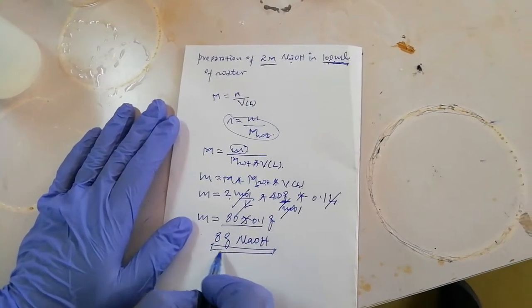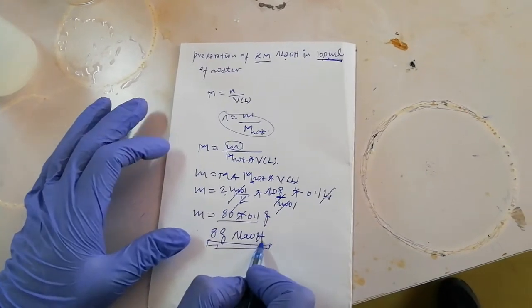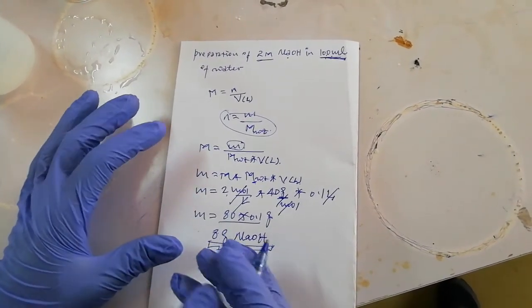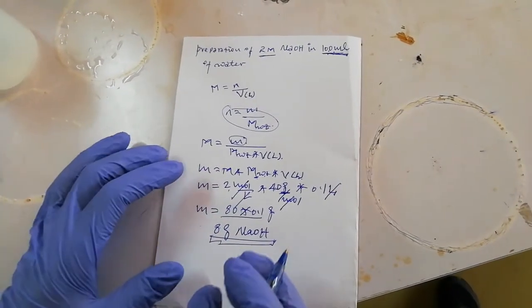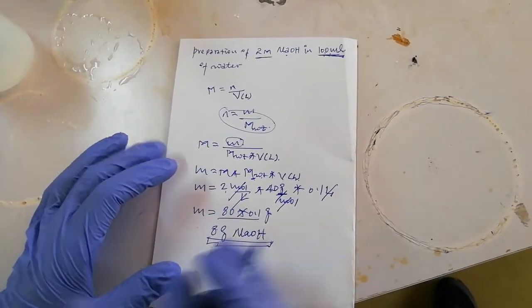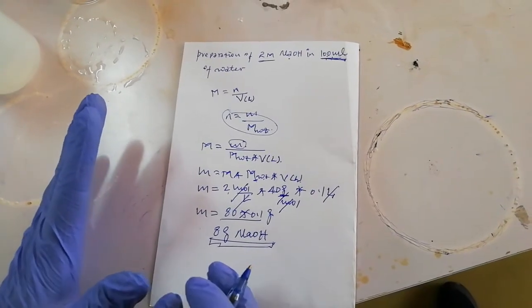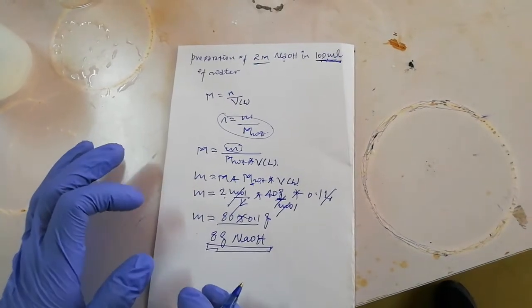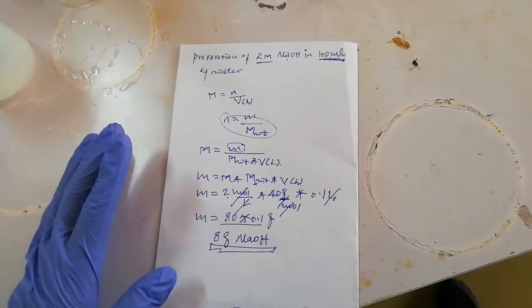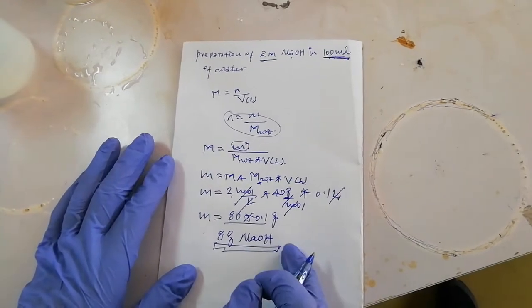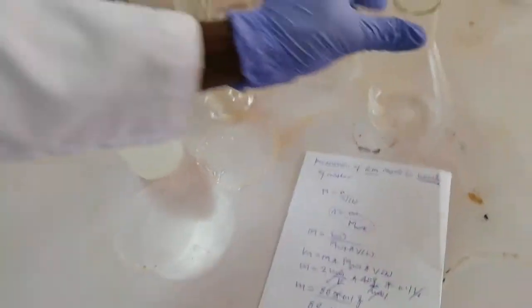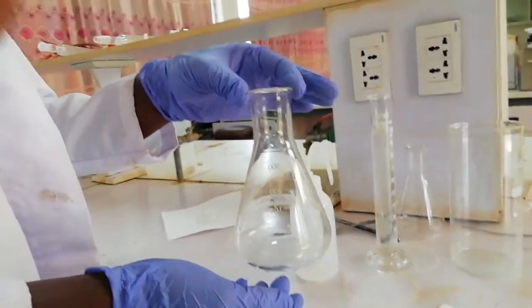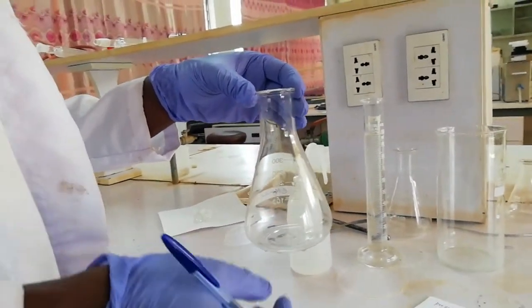Now we weigh 8 grams of sodium hydroxide on a digital balance, then transfer it into a beaker or conical flask, then add some amount of water and dissolve it. After that, we accurately measure 100 mL of water and add it into a beaker or conical flask. This conical flask, also called an Erlenmeyer flask, is used in a chemical laboratory to prepare solutions.